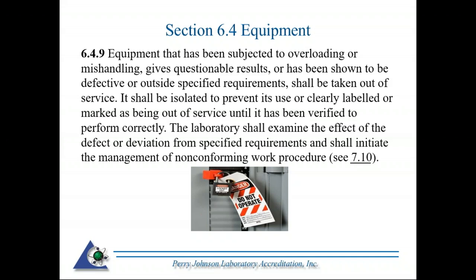So in other words, if your equipment is malfunctioning, it's giving suspicious results, it should be labeled, ideally isolated, so it's not used. Also, if for whatever reason it was discovered after the fact that the equipment was giving suspect results, and perhaps testing or calibration results have gone to the customer, the protocol established for nonconforming work would have to be followed, 7.10. So in other words, an impact analysis to determine whether or not it actually affected work that went out the door.